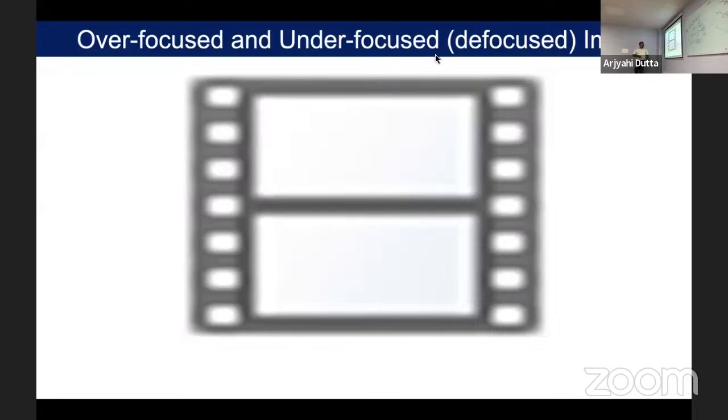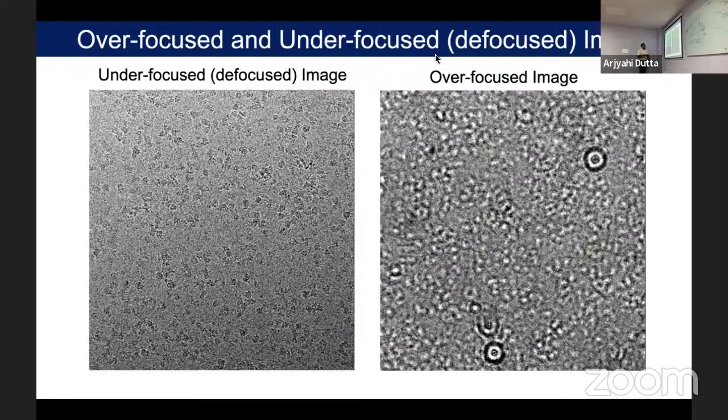So I don't know, did we discuss this one? Look, with any microscope, previously I was also thinking that when you talk about focus, that is basically not the actual focus, because our eye is comfortable with that part. That's why we say, okay, this is the focus. Okay, if you look at this video, that will be much clearer.